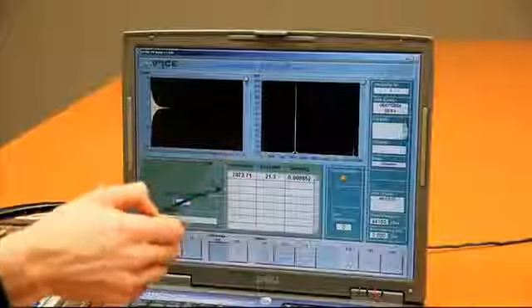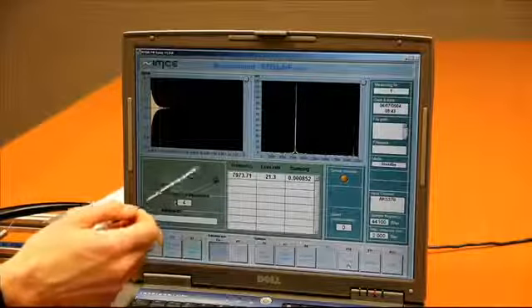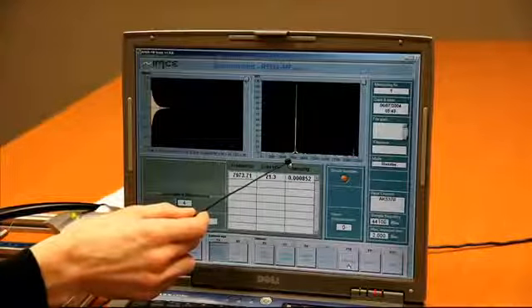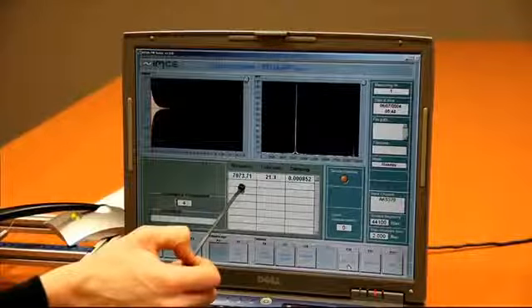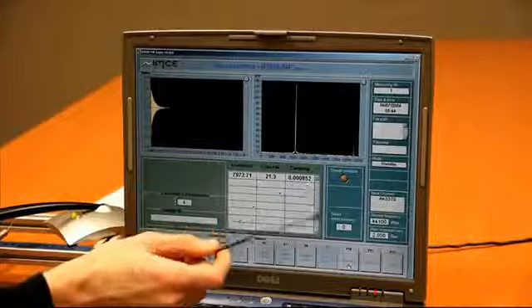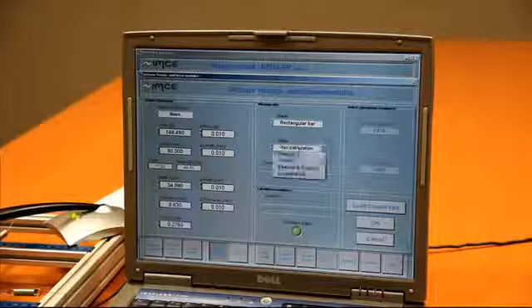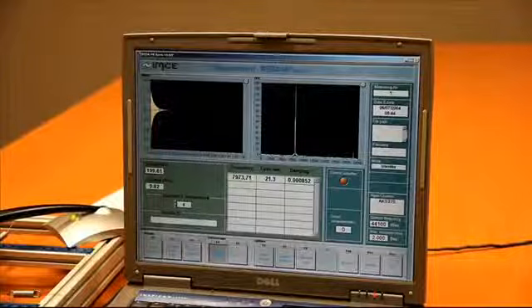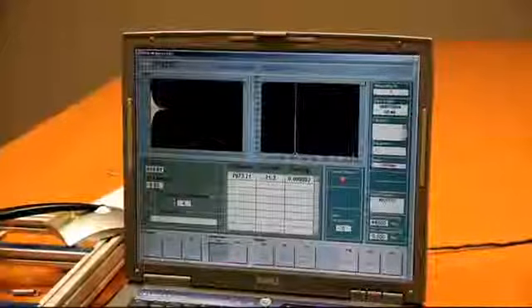In these two screens, the first shows the vibration signal that we recorded using the microphone. In the second screen we see the frequency spectrum with one large peak at around 7,900 Hz. This is the flexural vibration, and we see the internal friction. So now we tell the software that we measure the flexural vibration and we select the correct vibration. Now the software calculates the Young's modulus and the error on the Young's modulus.